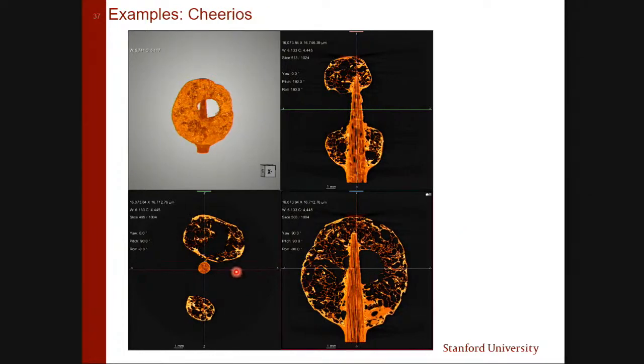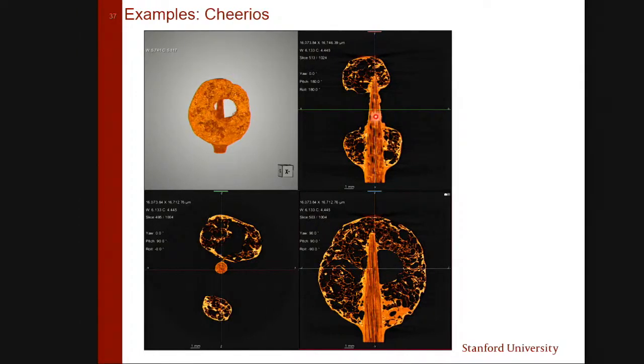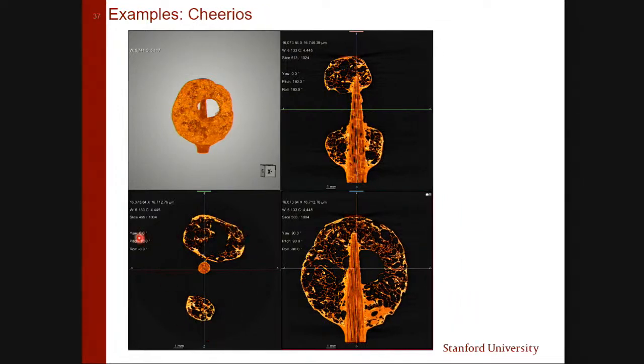And then by moving lines, for example, you get this green line, and you move it down, those two will change accordingly. So if you move it only down, this probably won't change, but here you will see something different, because you will be slicing at a different position, right? This way, by moving this line, you actually can investigate what you see at different heights through the sample. So this is what the reconstructed image would look like, because you're shining X-rays this way, and that's what you see now.